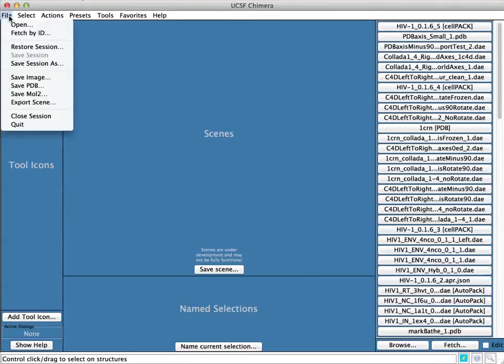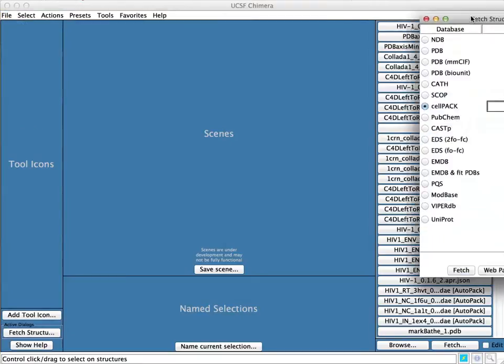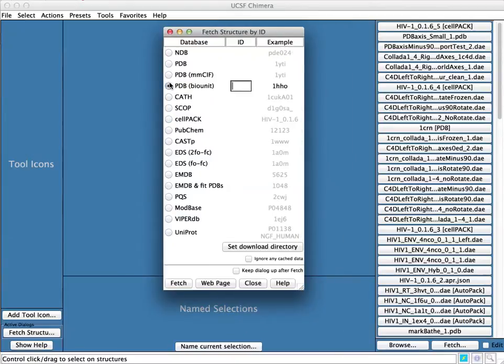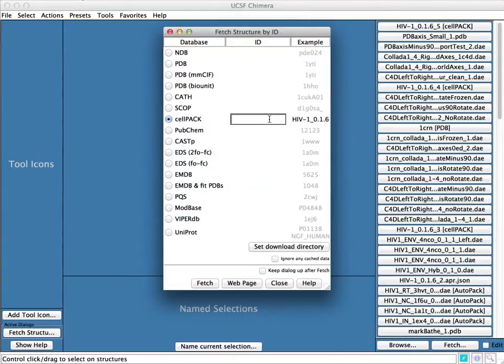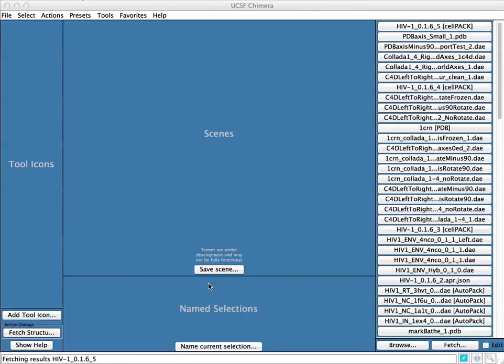Go to File, Fetch by ID, which will open this dialog box. Normally it will be set to Protein Database by default. You're going to switch that to Cellpack and you're going to paste in one of the available recipes here and click the Fetch button.